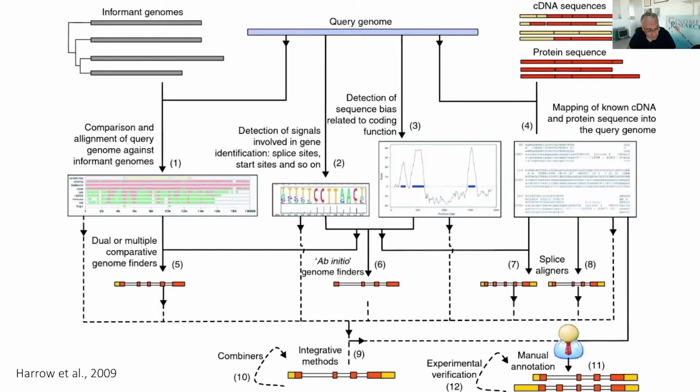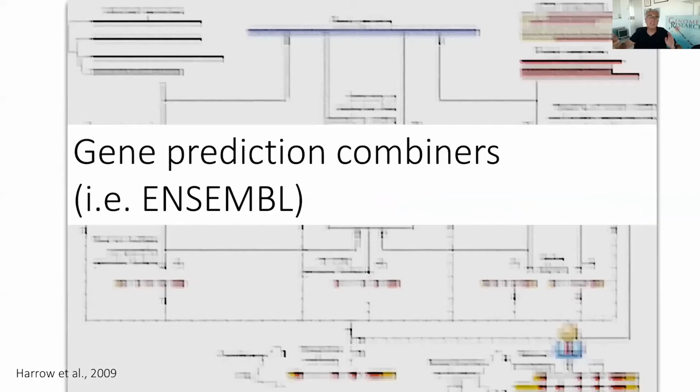And actually, in the practice of identifying the genes, and I will not go into the details of this because that's essentially recapitulating what I have said, methods that are used to predict genes in genomic sequences make use of all this information, from information intrinsic to the genomic sequence, as I said, protein coding bias, splice signals, stop signals, etc., to similarity to other protein sequences, intergenome similarities, mapping of cDNAs into the genome, etc. And for instance, there are many programs now that are based on the combination of all this information. Maybe the best known example is the Ensembl pipeline at the EBI.